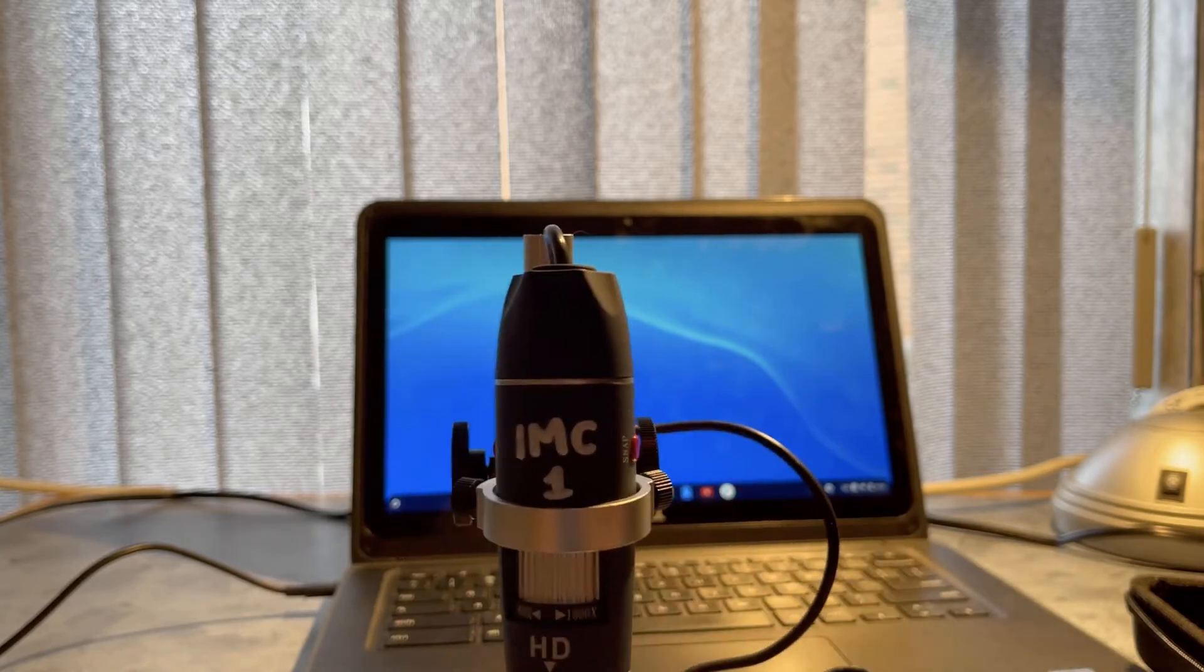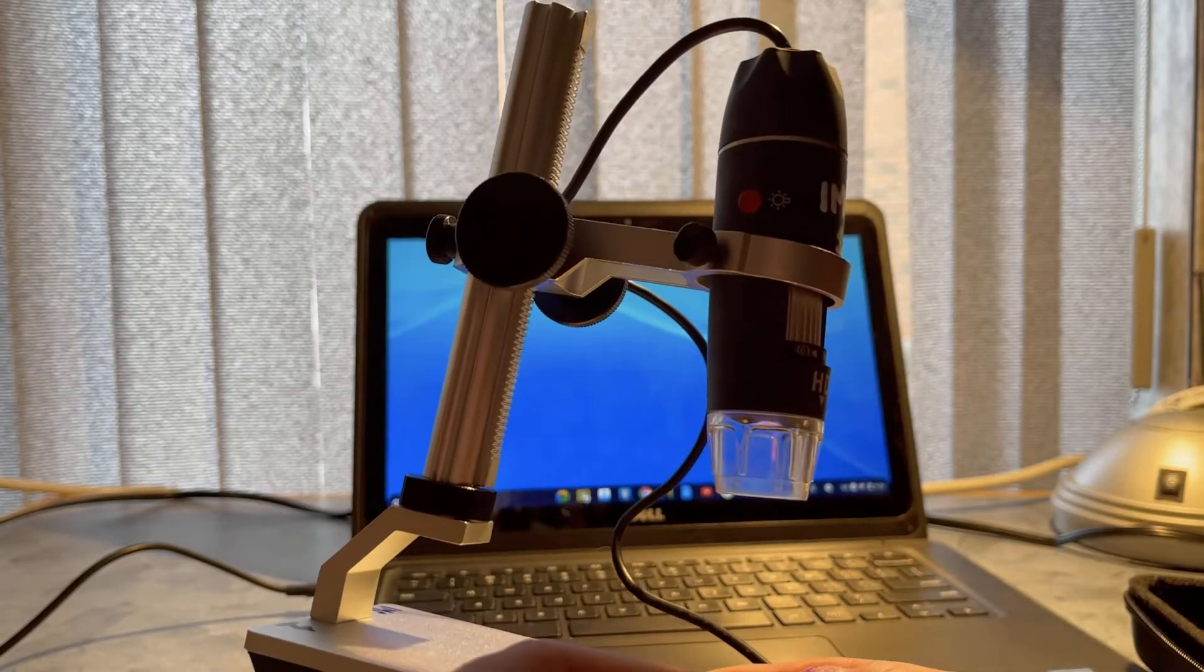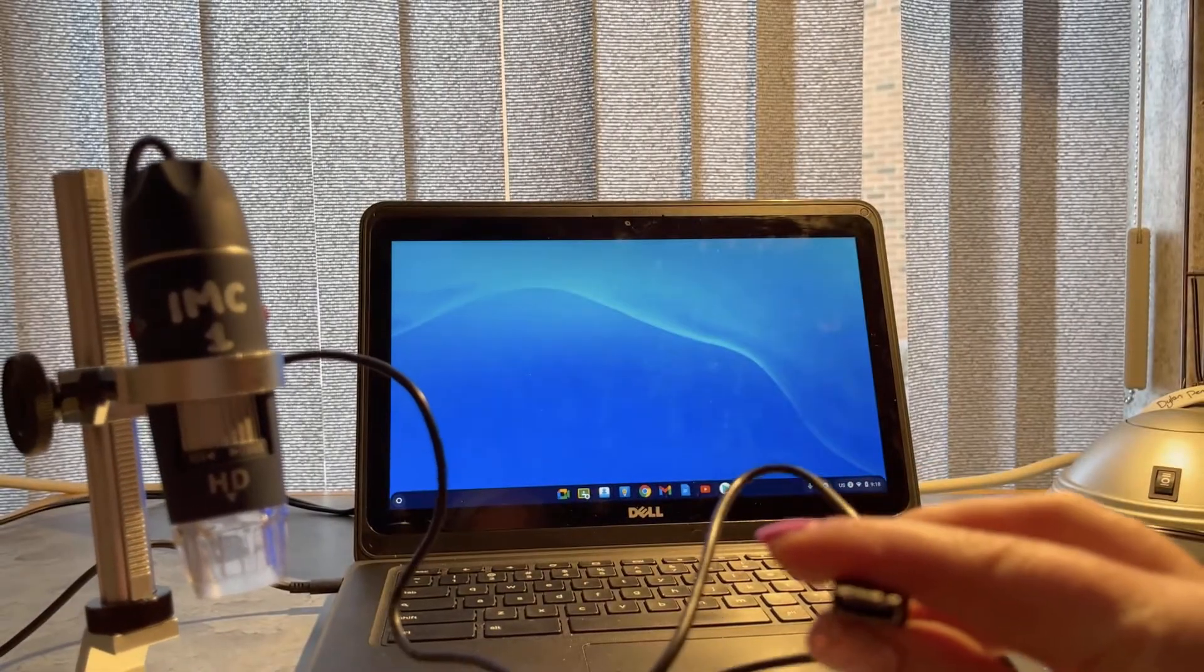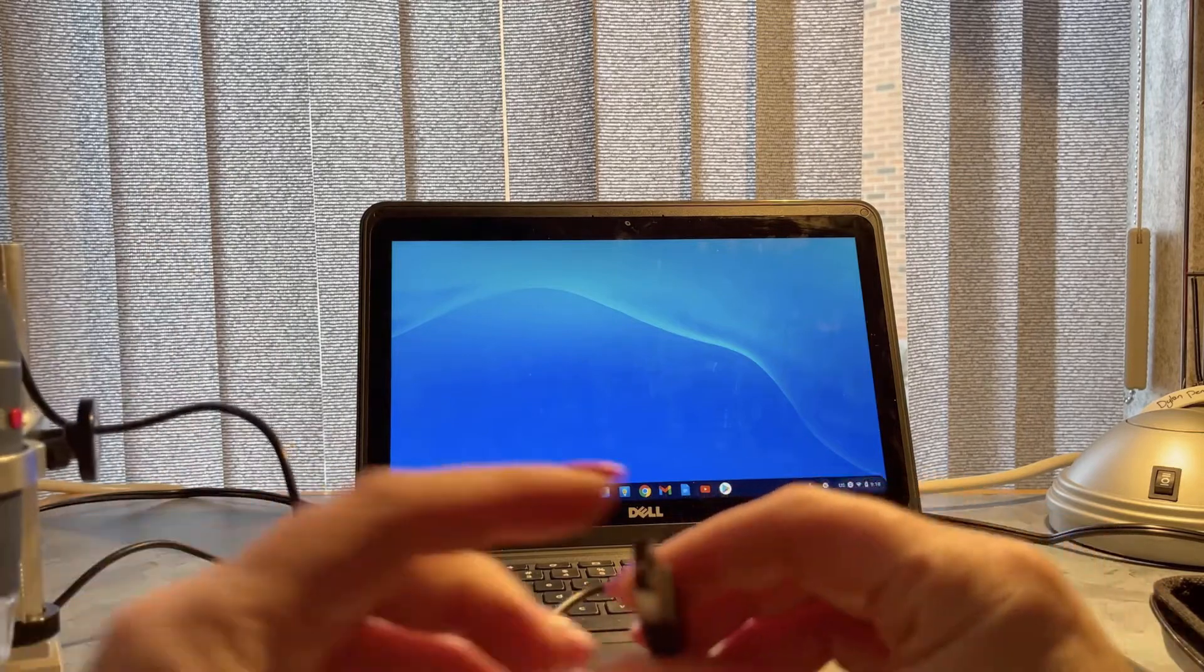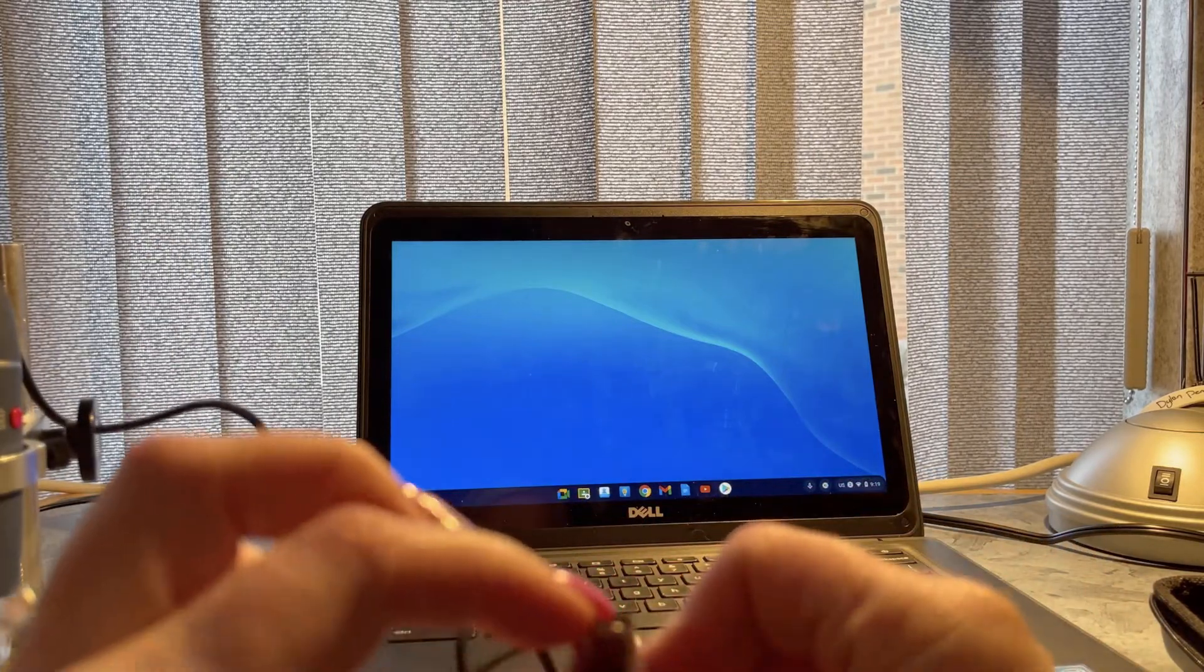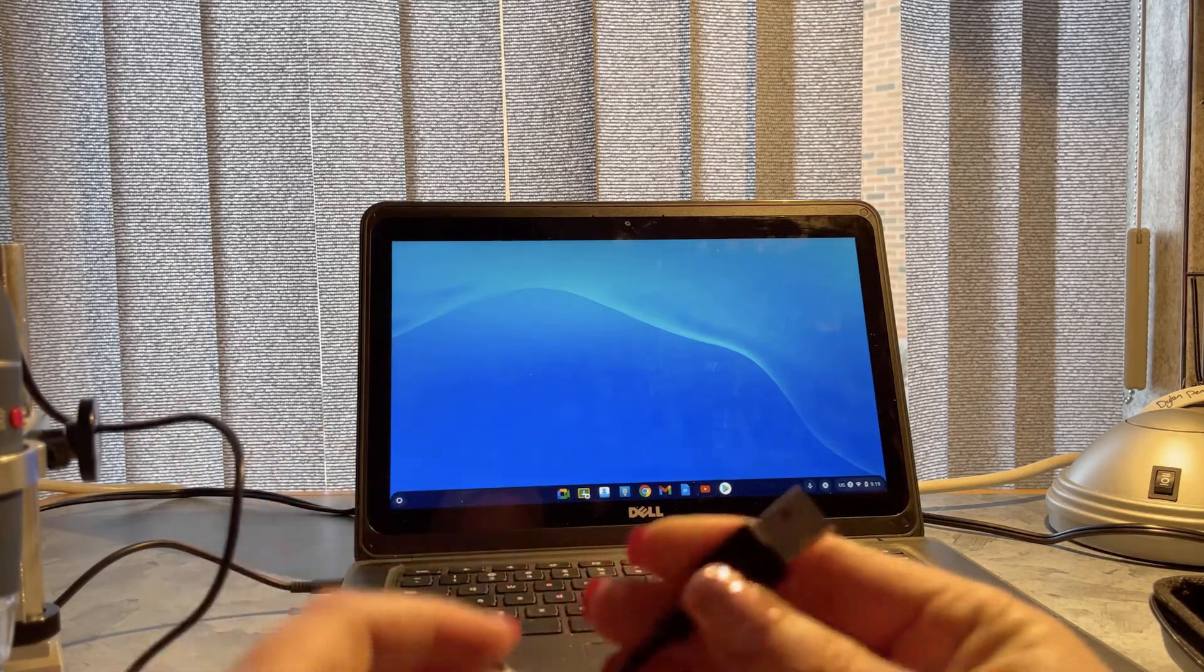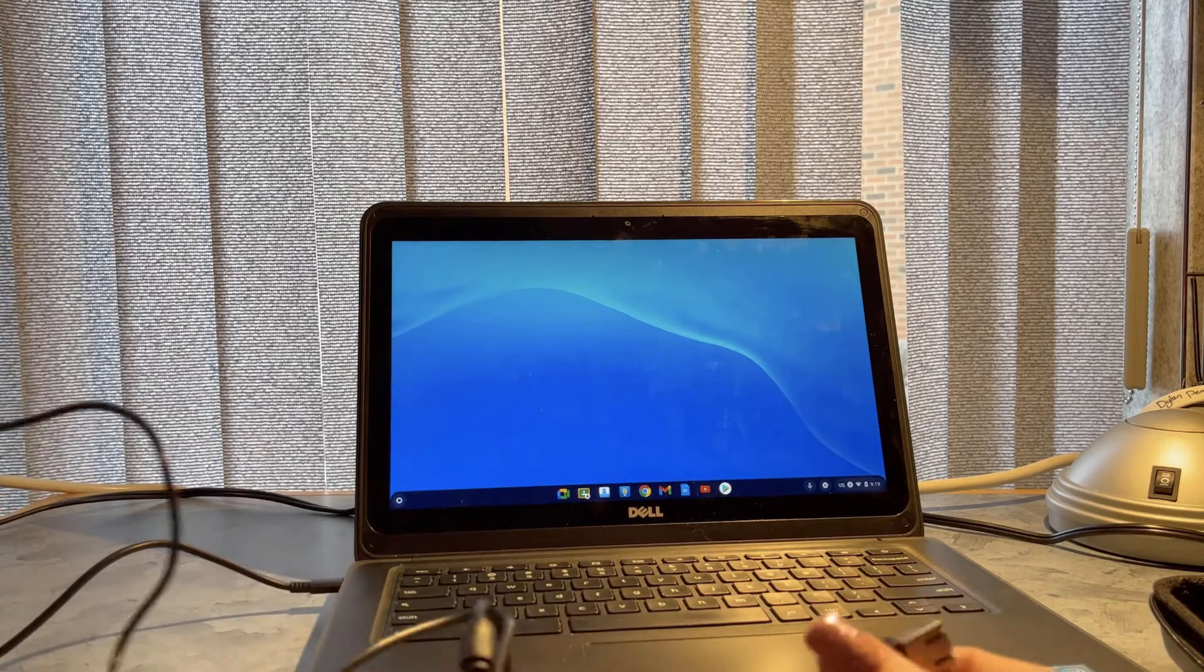Now it's just a standard USB for this particular microscope. If you did want to use it with an Android phone, it does have this little mini port in here as well. But we're going to be using these with Chromebooks.